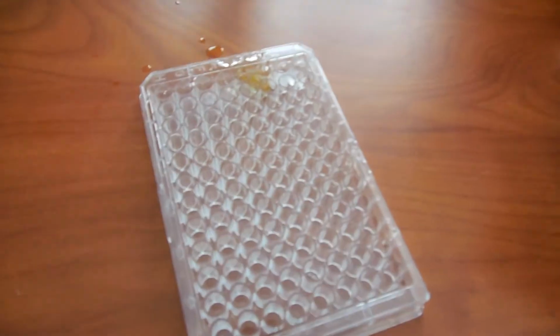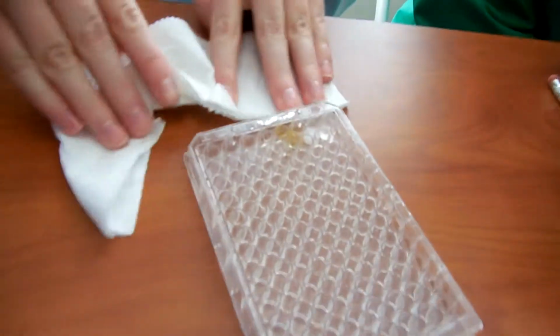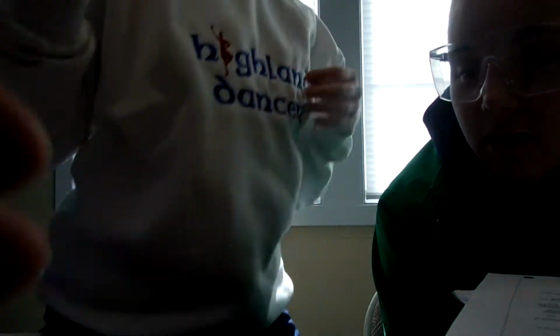Yes. So I see a precipitate. Clearly, that is here. Take that and head to the bathroom. There is a precipitate, but I'm pretty sure we've got some kind of contamination here because it poofed everywhere, and I'm going to try that again.